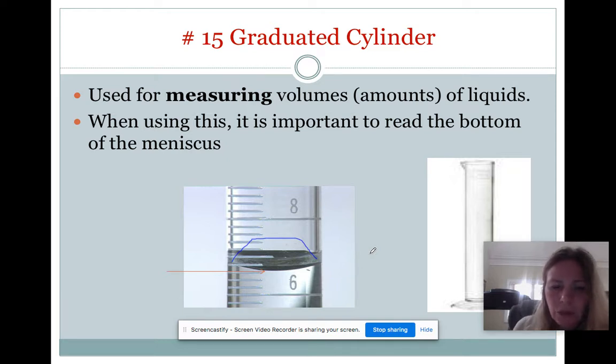So everyone always thinks there's a meniscus whenever you measure liquids. No, that's not true. It's only when you're measuring water-based liquids or mixtures, which again tends to be most of biology. But in chemistry, you wind up dealing with the opposite because the liquid itself actually wants to stick to itself more than the glass. So you actually get an upside down one. So again, that's just kind of a misconception that has been taught over and over again. But if you ever work in a real science lab or you're dealing with chemistry lab next year, it's always good to know the reality of it, which is only water-based solutions are going to have that meniscus.